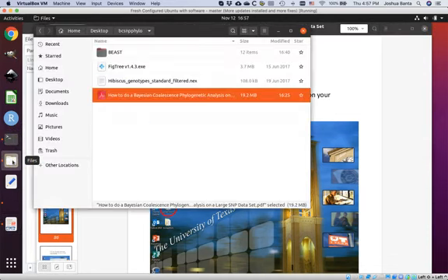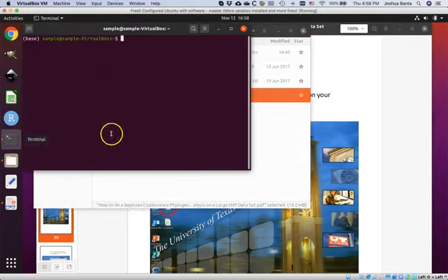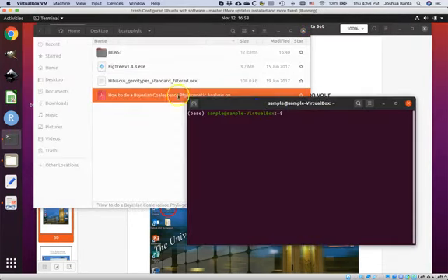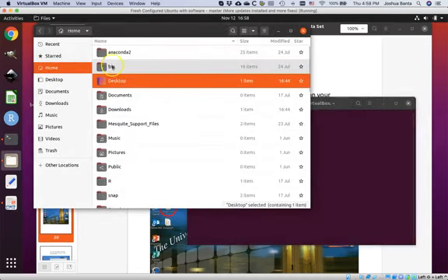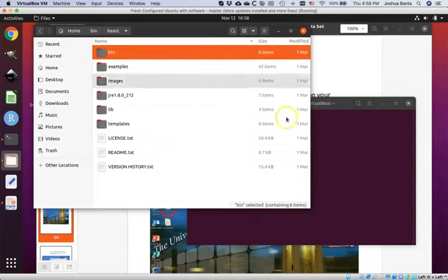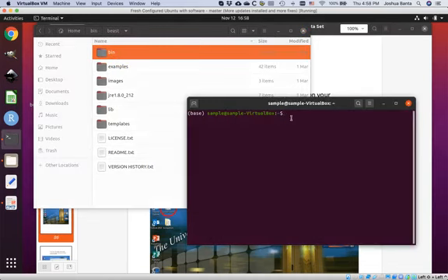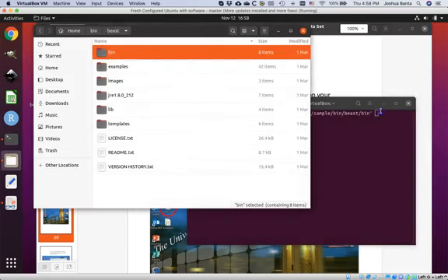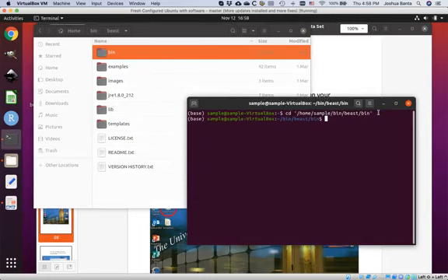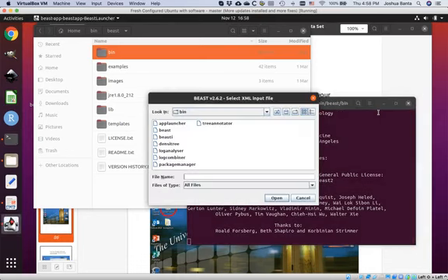Come back to file explorer and have that open, and come to the terminal window as well. Navigate in file explorer back to the home directory, then to the bin directory, then to the BEAST directory. Keep that highlighted. In the terminal, type 'cd space' and drag the bin folder within the BEAST folder to get the path. Hit enter. BEAST is also in this bin directory. To access it, type './BEAST' and hit enter. That opens up BEAST.